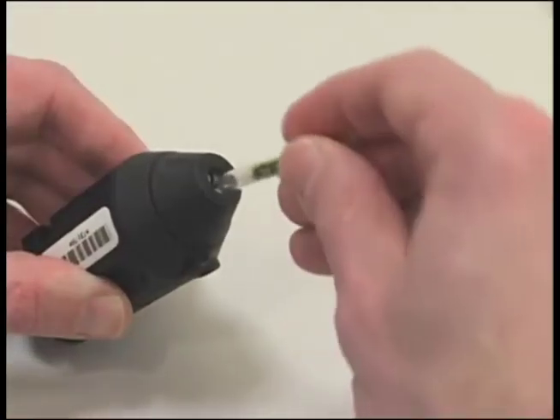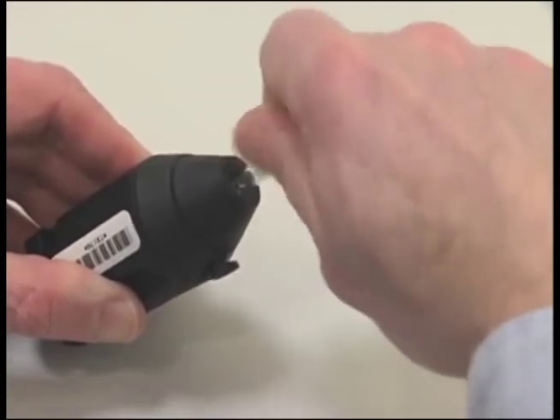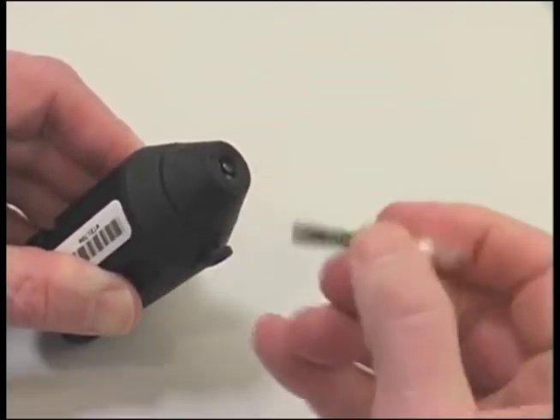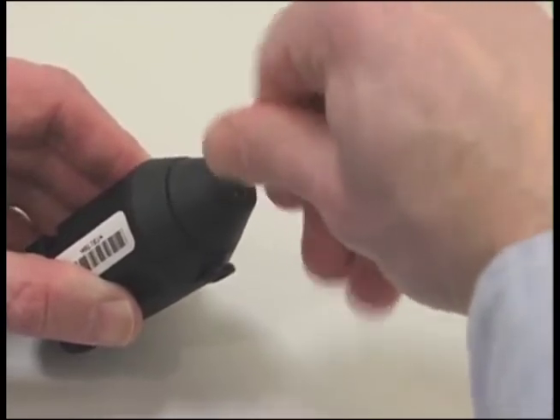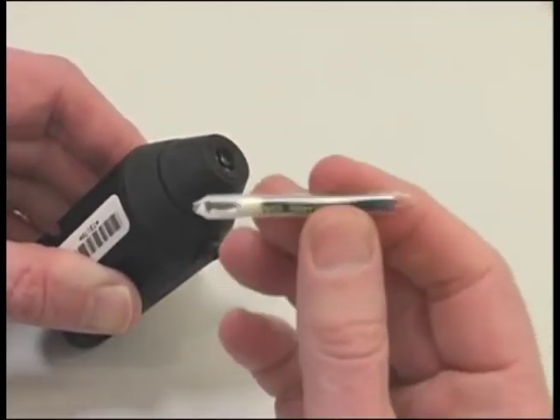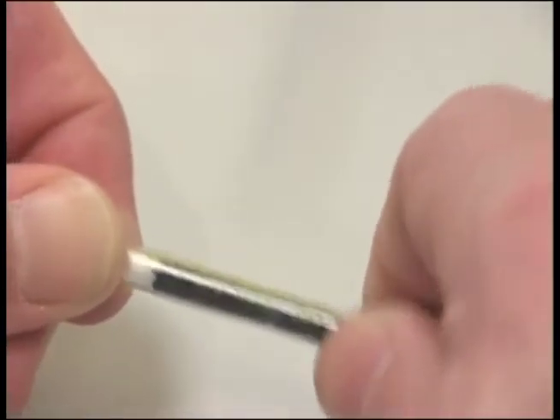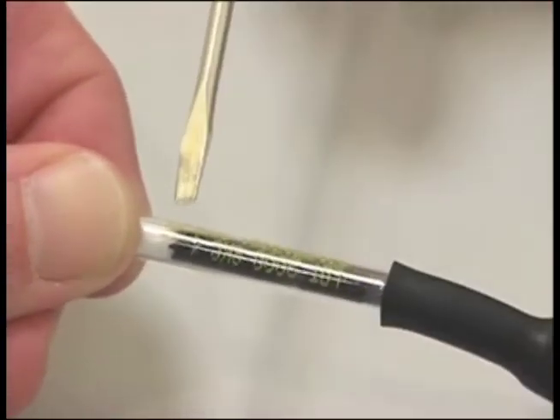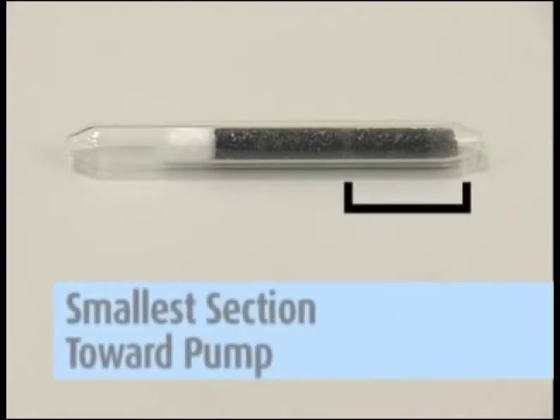Use a tube breaker to break both ends of the tube to provide an opening at least one half the internal diameter. Insert the open sorbent tube into the holder's rubber sleeve with the arrow on the tube pointed toward the holder. If the tube does not have an arrow, then place the end of the sorbent tube with the smallest sorbent section — the backup section — into the tube holder toward the pump.